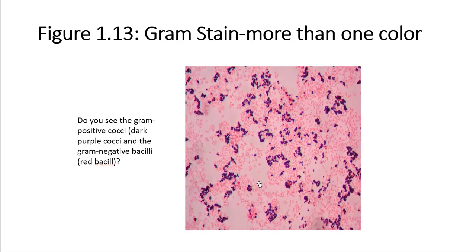Differentiate whether this organism is gram-positive or gram-negative and the shape of the organism. And this is why gram stain becomes so important, because it's a lot of information to the doc. All right. And that is our very typical, most common stain that's done in a micro lab.